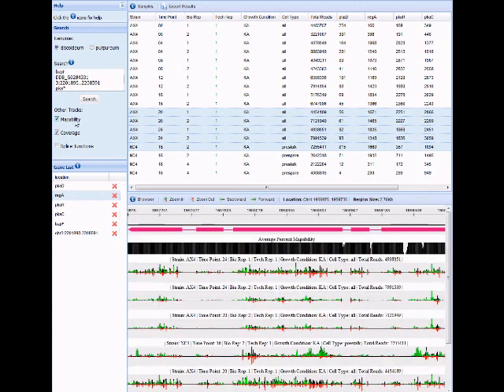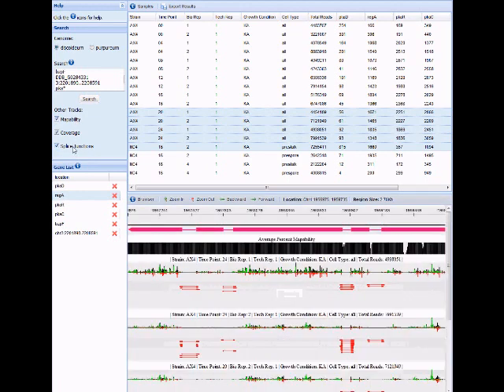Such as mappability, which will show you theoretically mappable regions, or the splice junctions within this region, showing up as these red bars within each of the tracks.